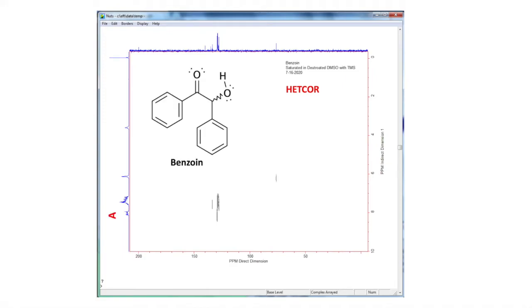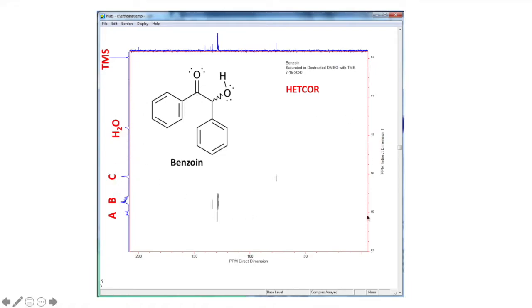Let's label these. We've got hydrogens: group A, B, C. And then we have water, which we talked about in the deuterated DMSO, and TMS at the end.